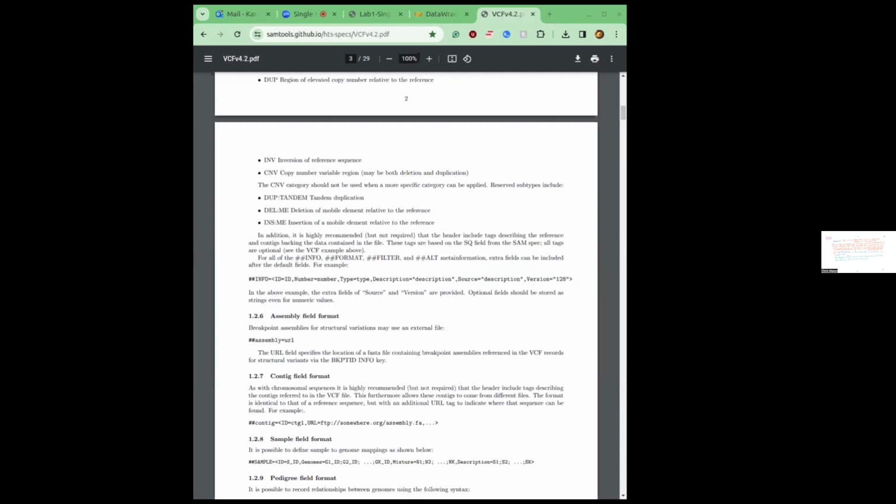So one of the ways you could try to do it is, I gave you a link to a whole Google Drive directory. You can just clone it to your Google Drive and try to run it from your side. And it contains the Google Colab.